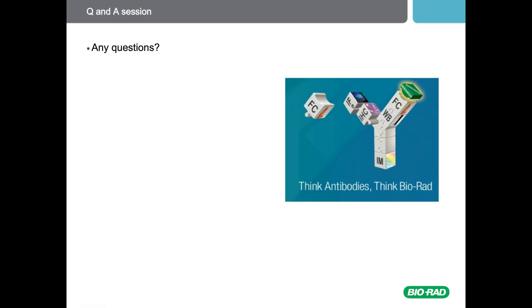We also have another question on dead cells, which is, how do I remove them from my sample? Well, the easiest way to remove them from your analysis is to do a live dead gating with a viability dye. However, if you actually want to physically remove them from your sample, the best thing to do is a Ficoll centrifugation as you do in a blood prep.